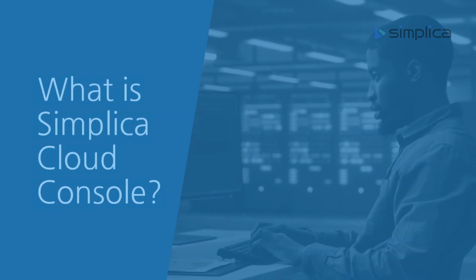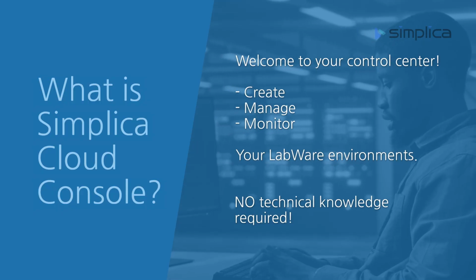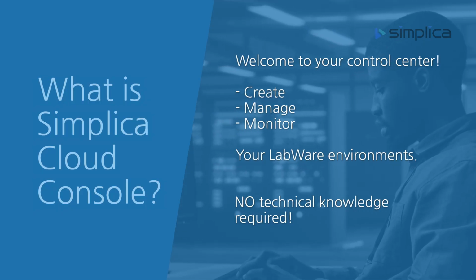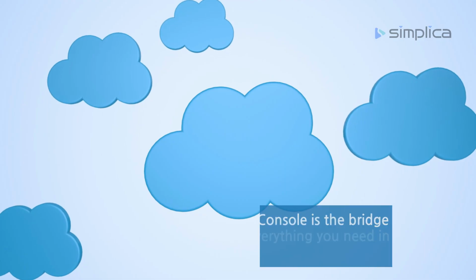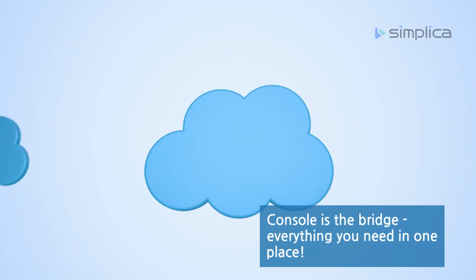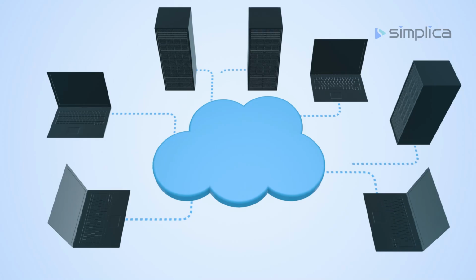At its core, Simplica Cloud Console is your control center. It's the place where you create, manage, and monitor your LabWare environment without needing to worry about what's happening behind the scenes. We handle the infrastructure for you. Think of the console as the bridge between your application and the infrastructure running it.